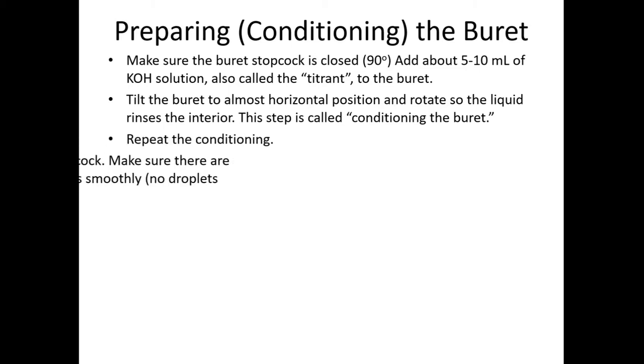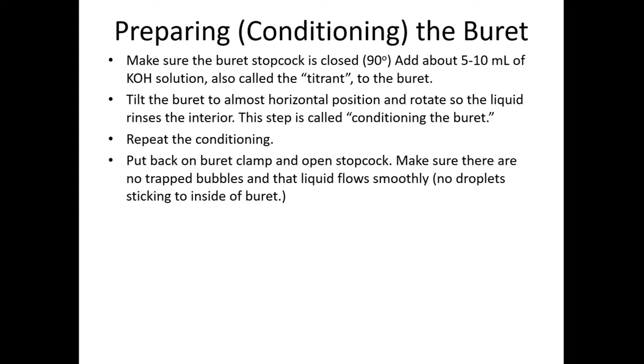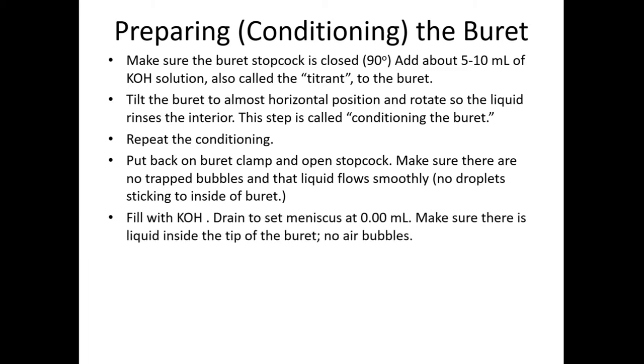We get rid of any residual water from the wash of the burette. We'll repeat it, maybe a couple of times, and then we'll put it back on the clamp, open it, and make sure that there are no trapped bubbles and that the liquid flows smoothly. We'll refill the burette with KOH and drain it just to get the meniscus back to 0.00 milliliters, making sure there's no air bubbles trapped, especially in the tip of the burette.